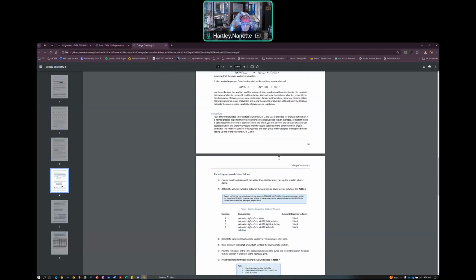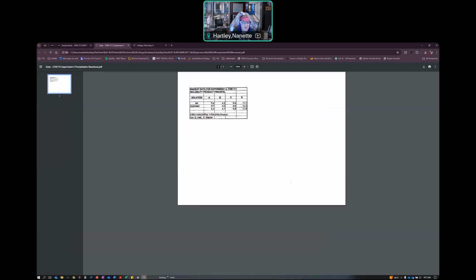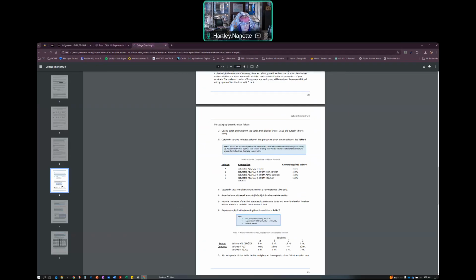We did each of these titrations, and we did a solution of saturated AgC2H3O2. In our beaker we had our 0.05 molar KCl, and the saturated AgC2H3O2 in water is the material in the burette. We added 5.3 milliliters of that solution to the 0.05 molar KCl in the beaker to get to the endpoint of that titration. So that's how much we added.